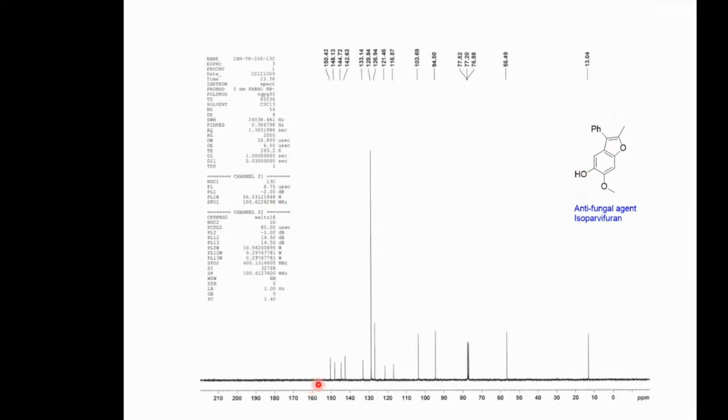And the most deshielded ones, you have two here, and one this, and one this, four. So there are four carbons with oxygen attached. I will assign these four for that. So what we should do is assign the easier ones. That is how we logically build up the assignment and then look for internal consistency. Leave the tough one to the end.